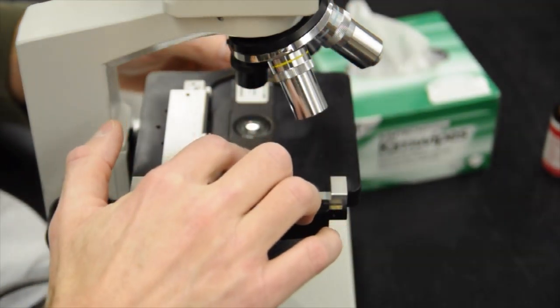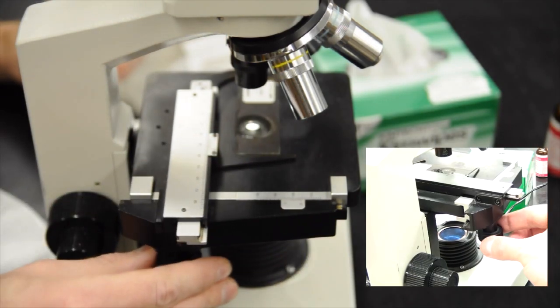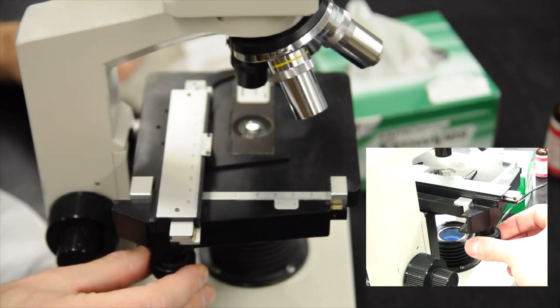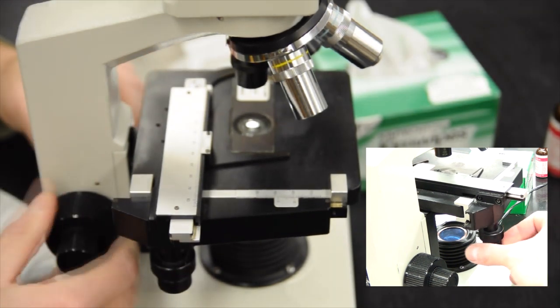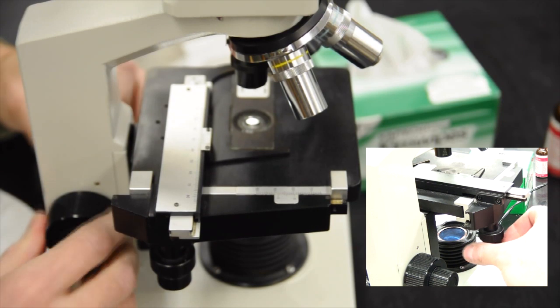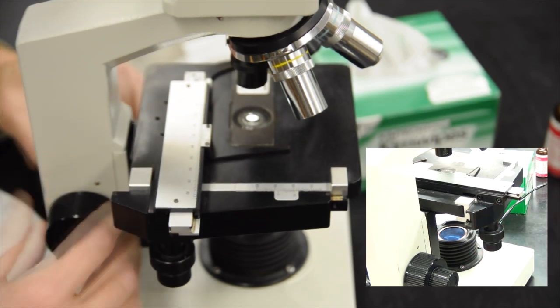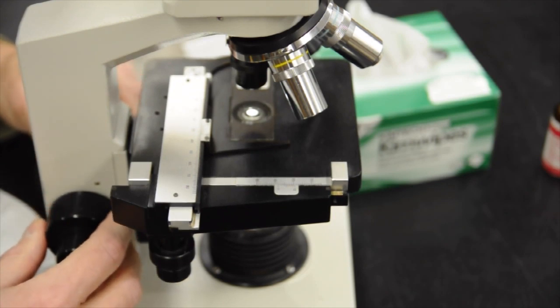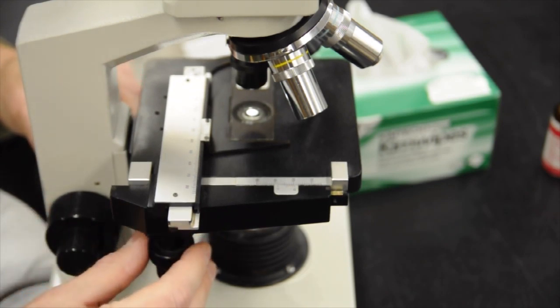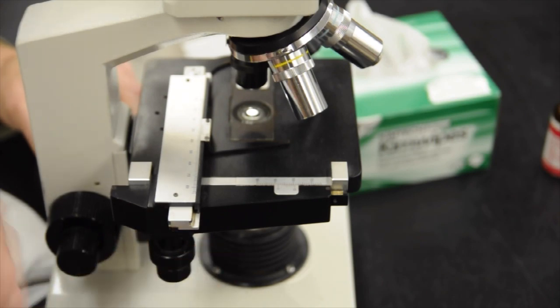Put the slide into the mechanical stage. Make sure it's on the edge and that the clamp is closed. Now you've got the ability to move it. The top knob will do it in the Y position and the bottom knob in the X position. Then with your coarse knob adjustment on the lowest objective, move it up into focus. It's always a good idea to move it around just to make sure you're in the right focal plane.